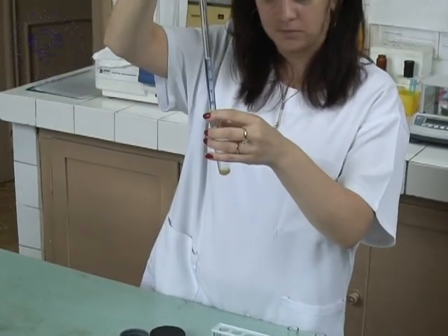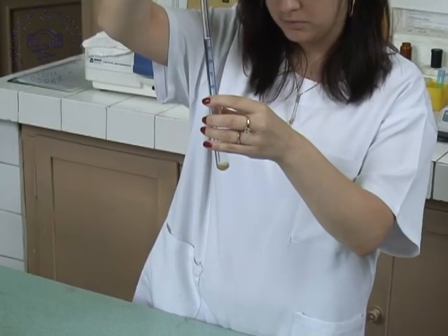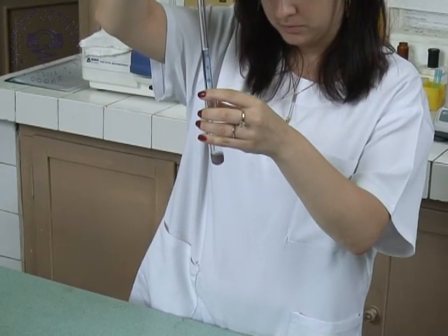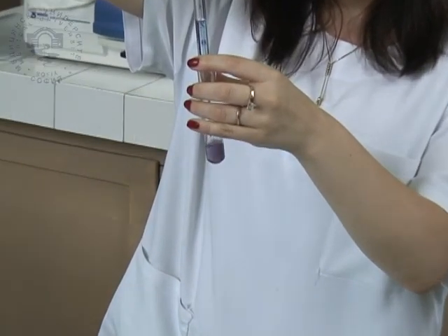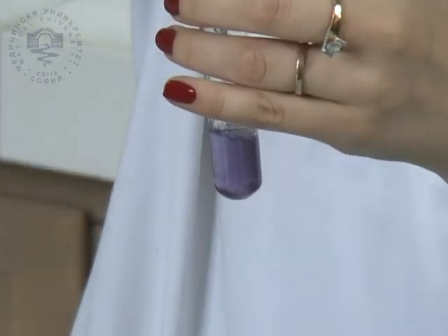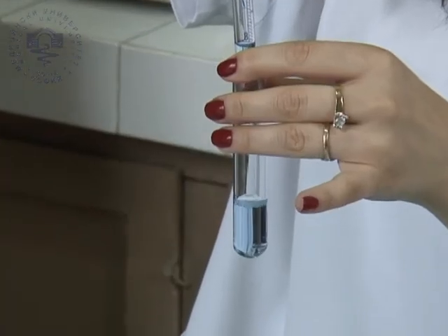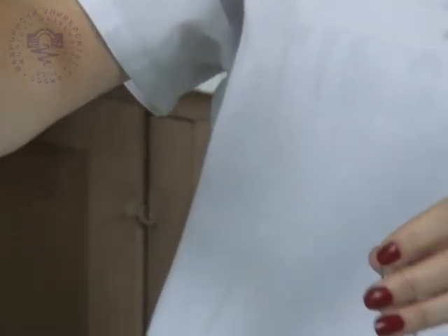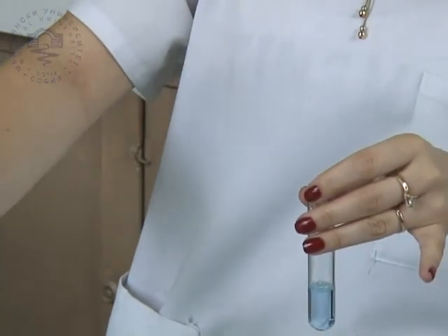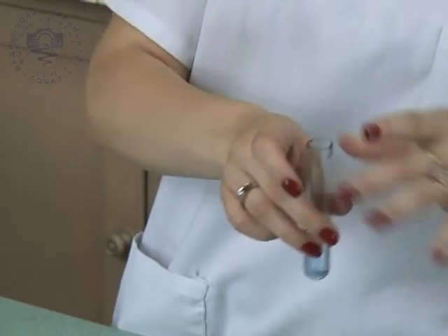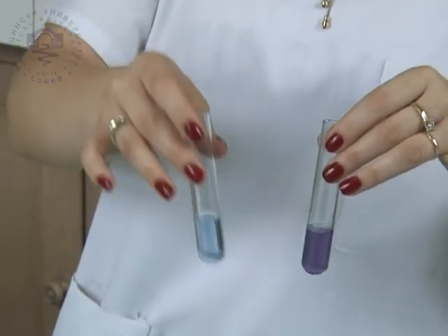After that, the biuret reagent containing sodium hydroxide and copper sulfate is added to each test tube. It is shaken and incubated for 30 minutes at room temperature, or for a minute at 100 degrees centigrade. The change of color from light blue to violet shows that the biuret reaction has occurred.